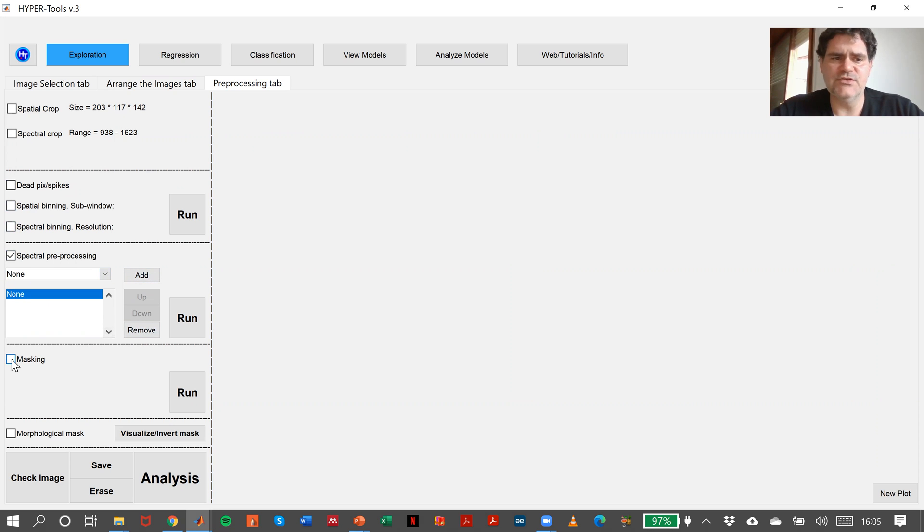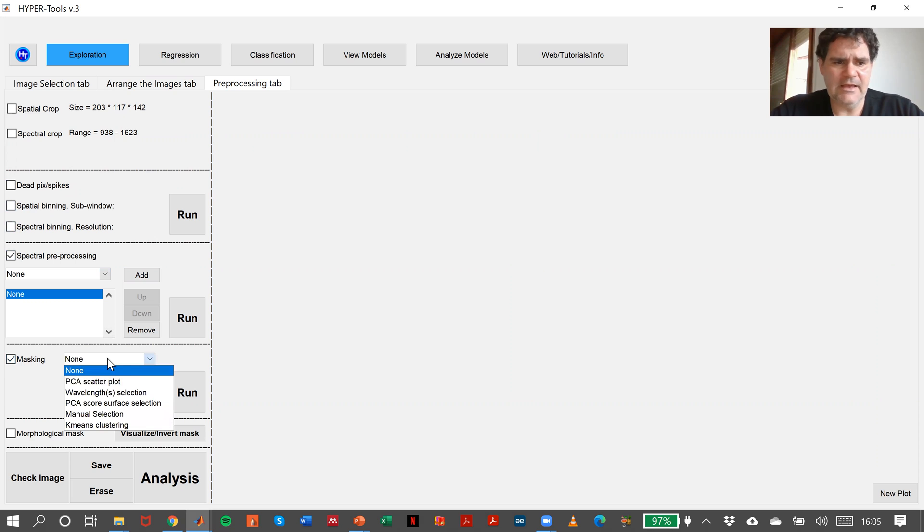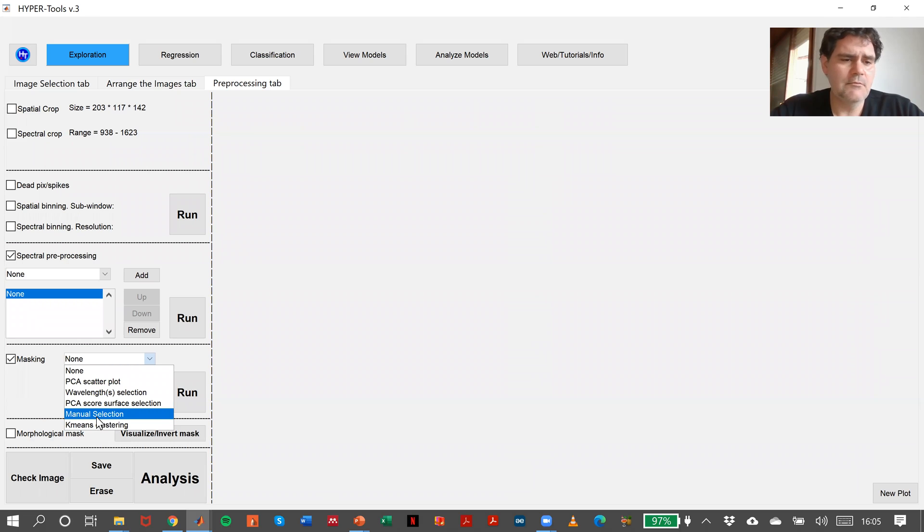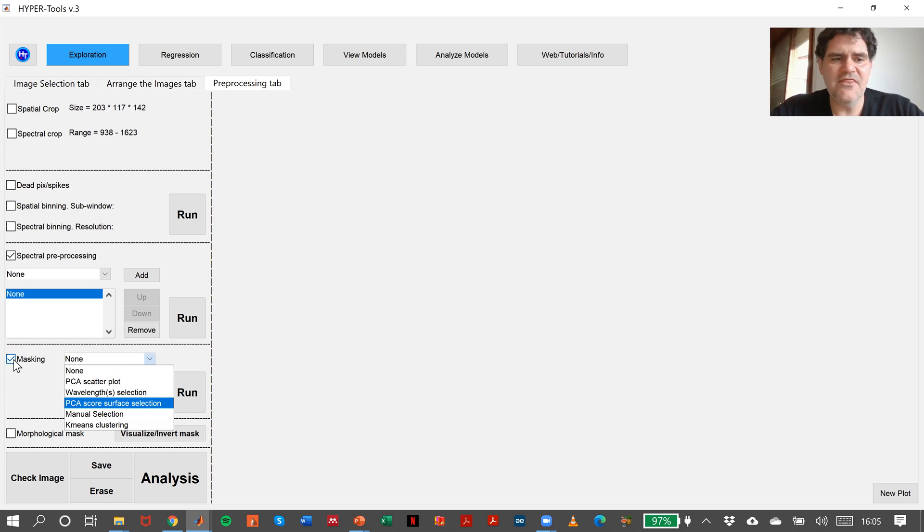Then we have some masking preprocessing methods like PCA scatterplot, wavelength selection, PCA score surface selection, manual and k-means.